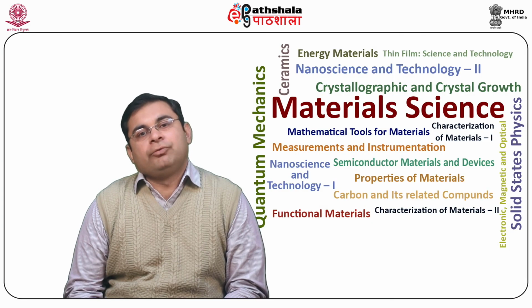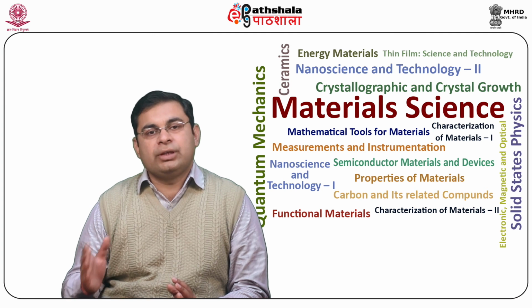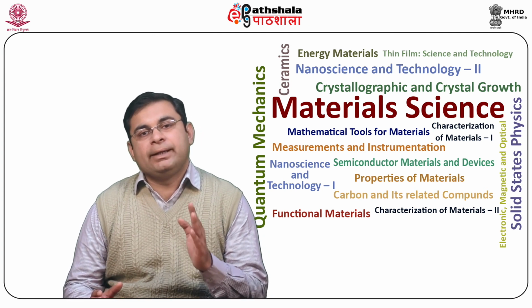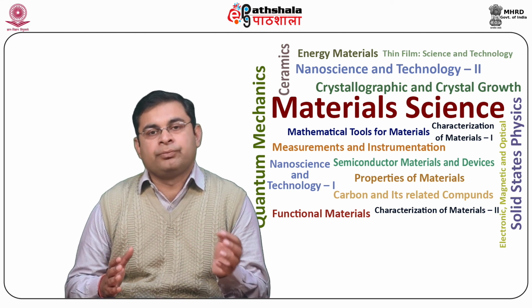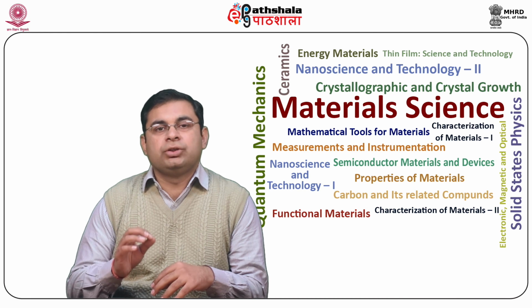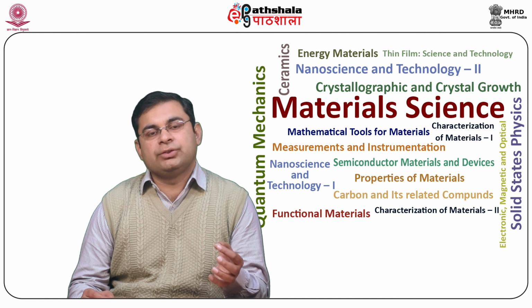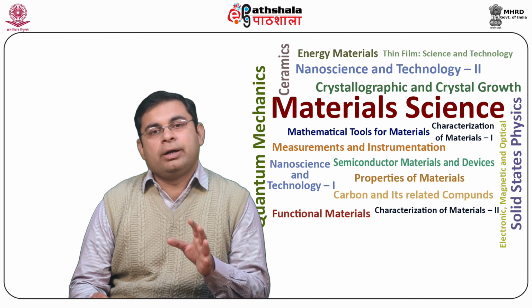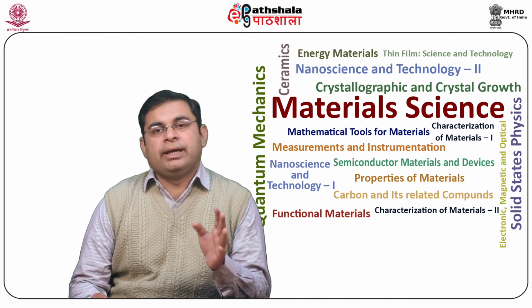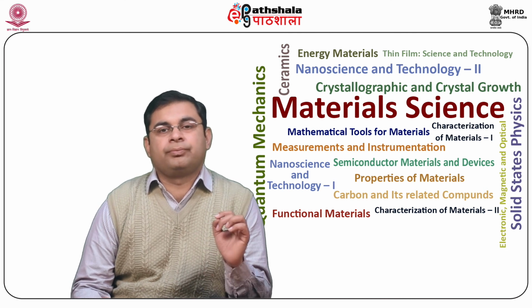In this experimental configuration shown in figure 3, first the focused electrons get incident on a solid sample, and then the emitted electrons get deflected towards a cylindrical mirror analyzer. In the detector, Auger electrons get multiplied and the signal is advanced for data processing. Finally, the accumulated Auger electrons are recorded as a function of energy against a broad secondary electron background spectrum.